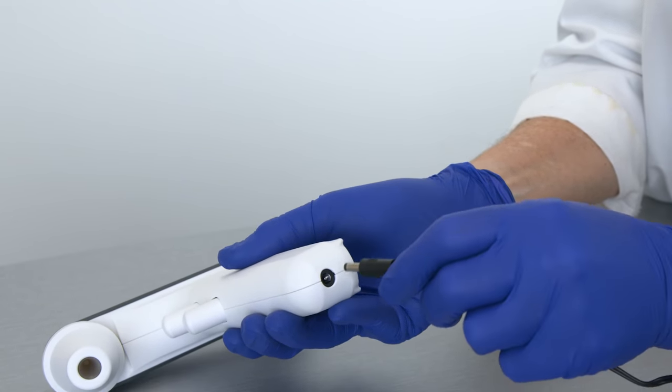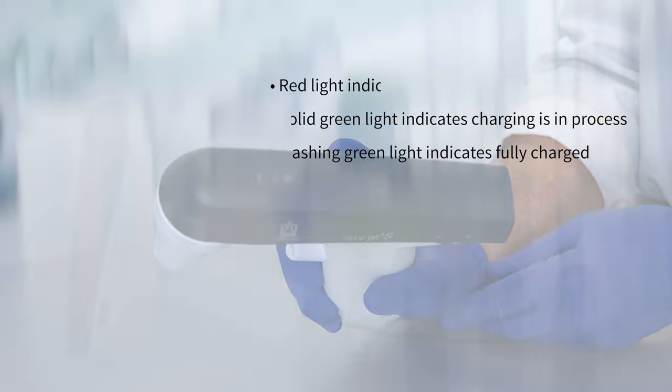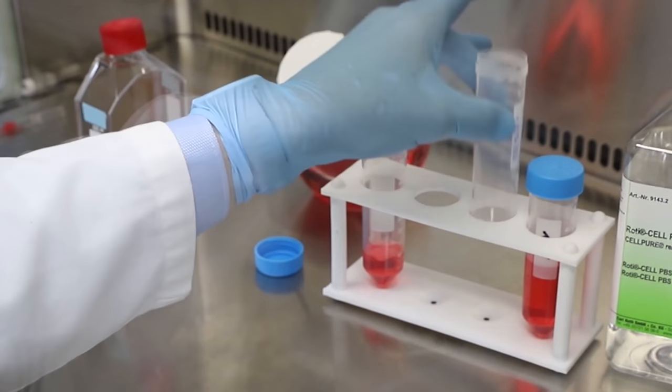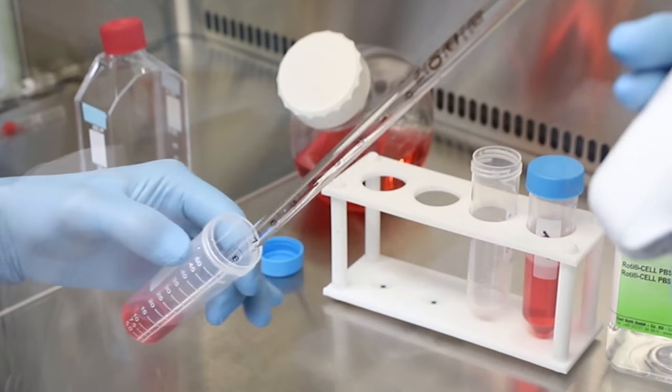Connect the power cord to the AccuJet S and charge. The LED charge lights will turn green, indicating the AccuJet S is charging. You can use the AccuJet S while it's on the charger.